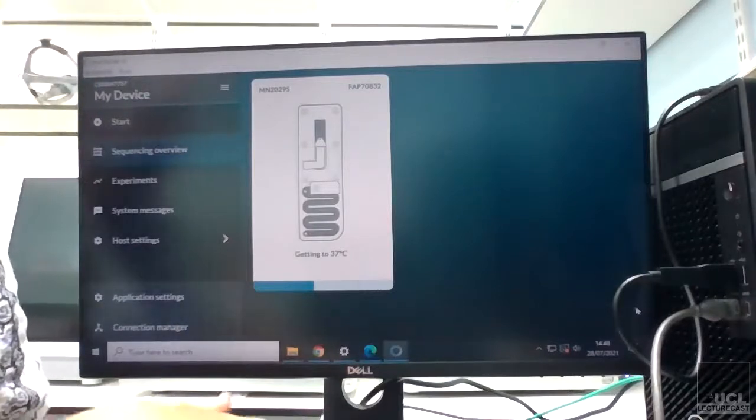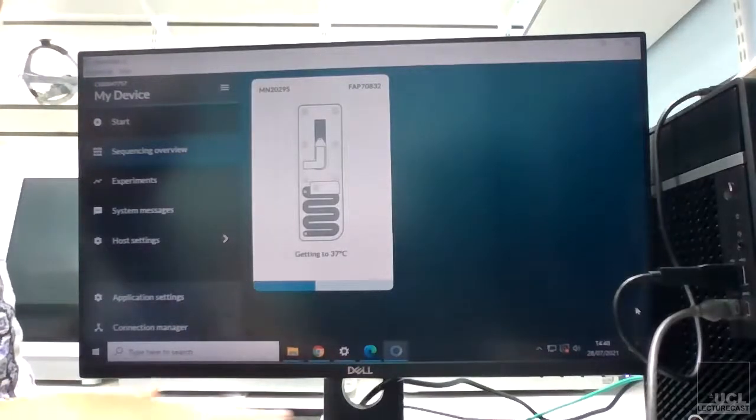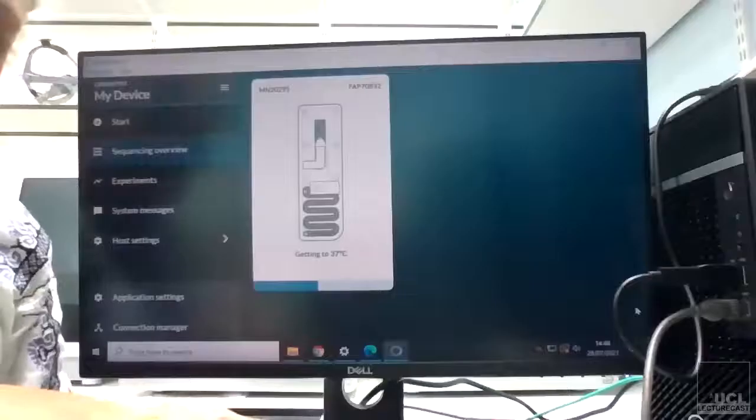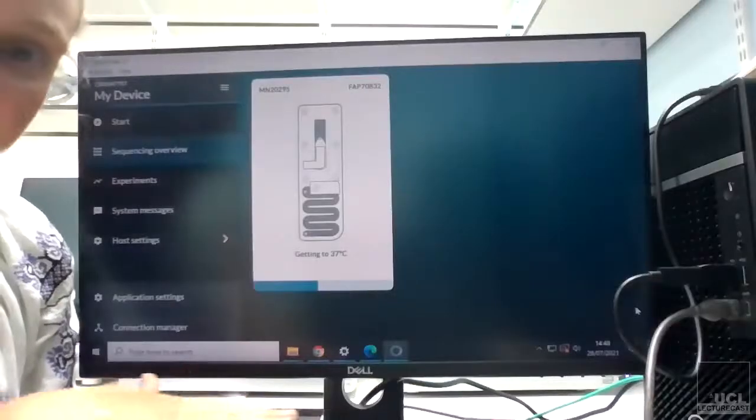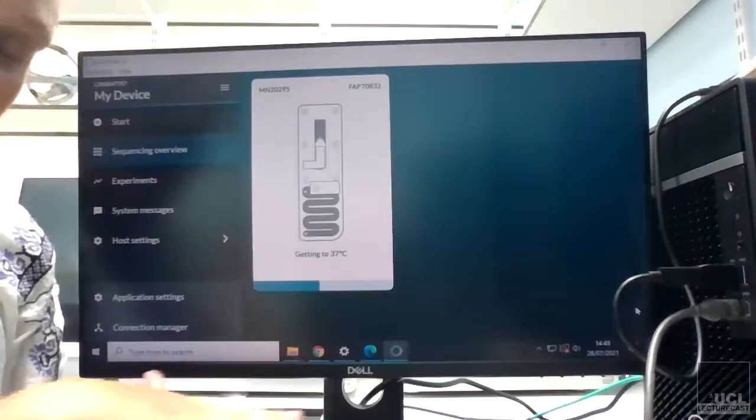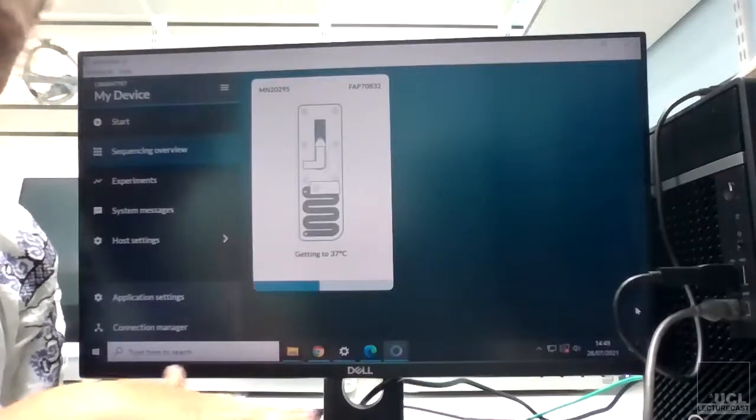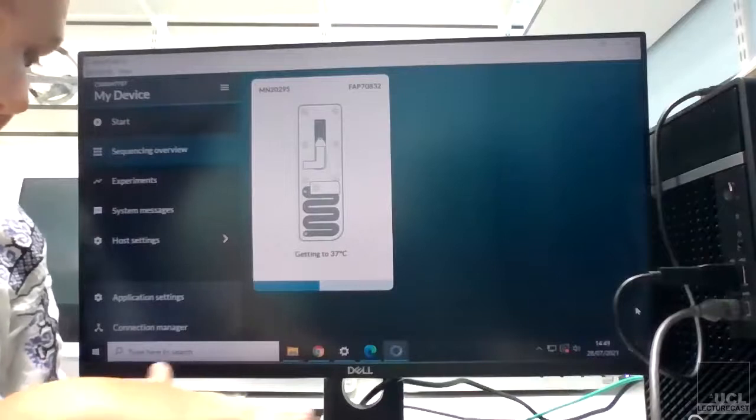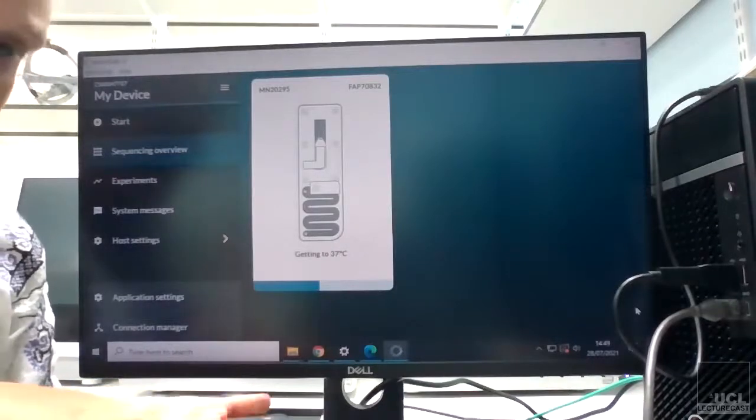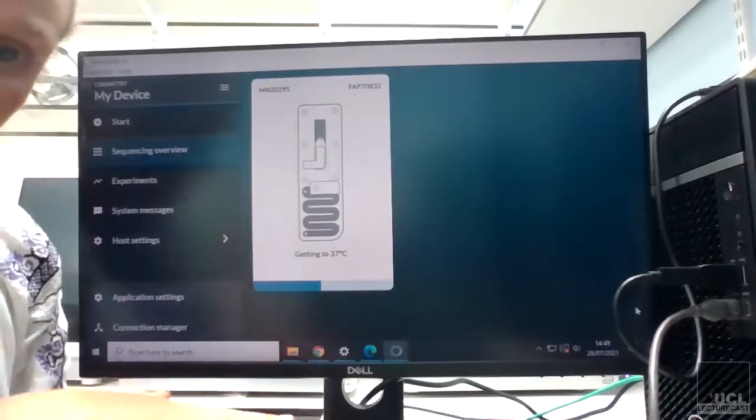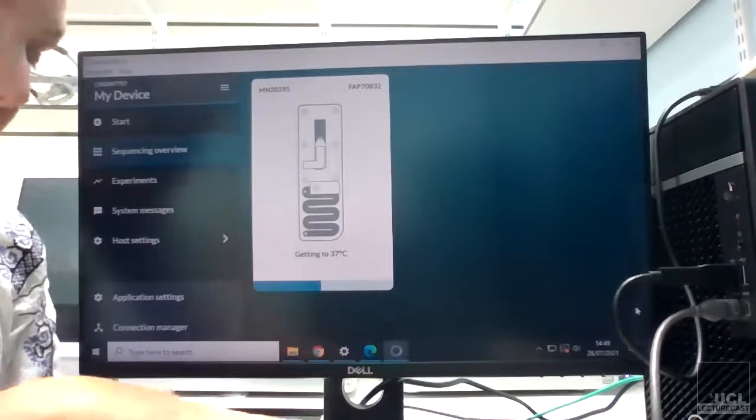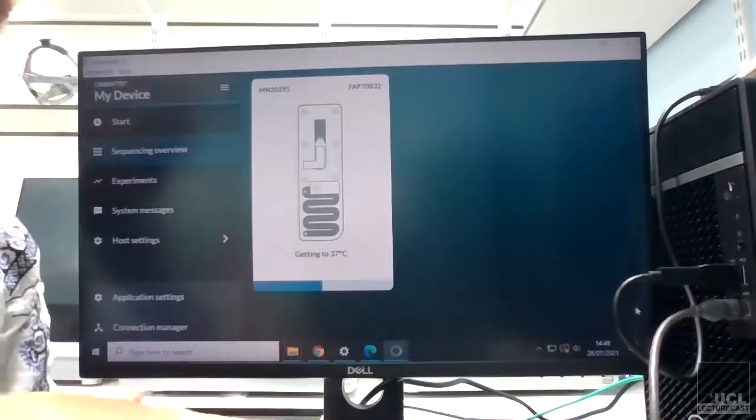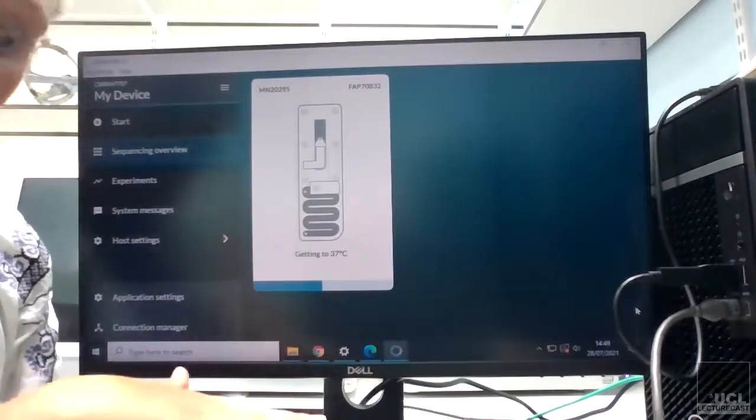So yeah, the QC check is what's called a dry QC, because you're not adding any buffer or any liquid or anything. You're purely just doing an electrical check of the pores that are on the flow cell to see whether they're actually working or not.